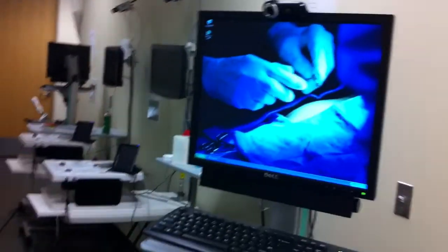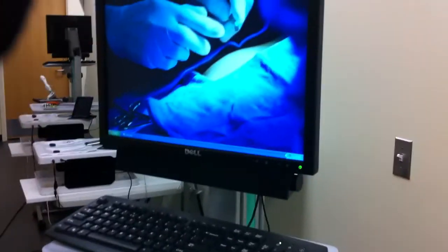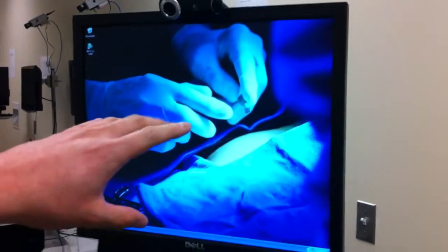The next step is to calibrate the whole system. Here, okay. Let me put this in front, actually. Yeah. Is that better right there?